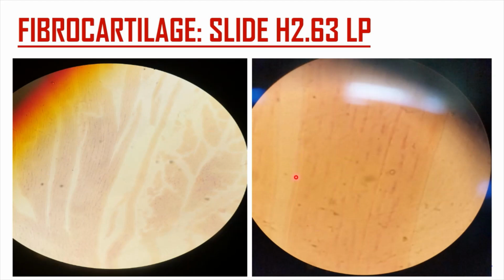This is low power. You can see this is not very clear, but these are collagen fibers. This is dense regular connective tissue. And what you see here, these are the chondrocytes that are embedded in the dense regular connective tissue in lacunae.